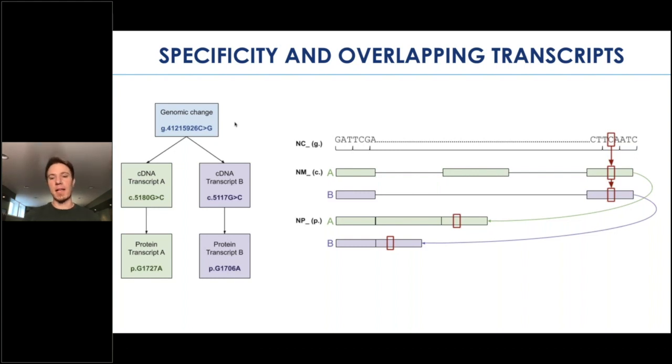And so with that in mind, that is why we've introduced these new, more specific buckets of intronic variants. It's also why we've started to prioritize the nucleotide specific matches at the top, so that you have a better chance of always seeing the most specific results, and then you can keep looking down into the more sensitive results if you still haven't found what you're looking for, and not risk missing something because, for example, we've decided to compromise on sensitivity, which is something that we don't want to do.